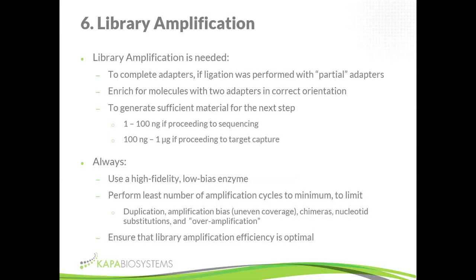And then overamplification, and we'll talk about overamplification a little bit. Always make sure that your library amplification efficiency is optimal. If you're thinking back to the beginning of this protocol, we said we're separating fragmentation from the core library process from amplification, so it allows us to optimize each one individually and assess the efficiency of each one individually. Library amplification is just a PCR. It's really easy to optimize. But it's important to understand how optimal your conditions are.